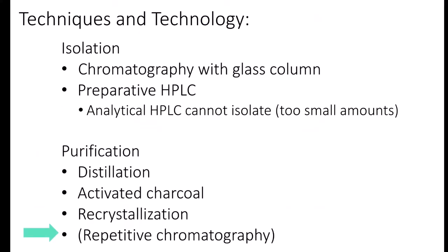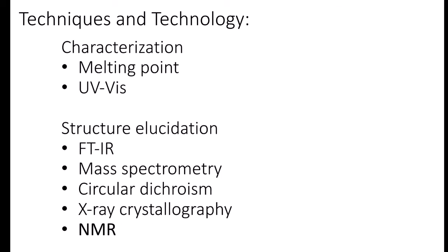Okay, last, this is just for emphasis, chromatography can still be used for purification. So there are times that one run of column chromatography is not enough. So you can repeat chromatography to purify your sample. Next, let's go to characterization and structure elucidation.